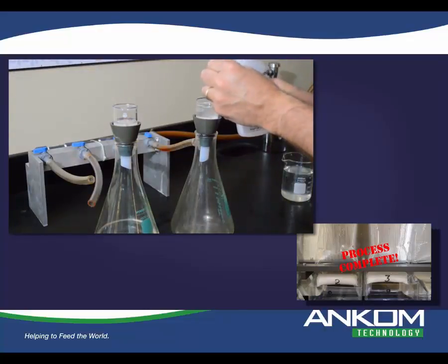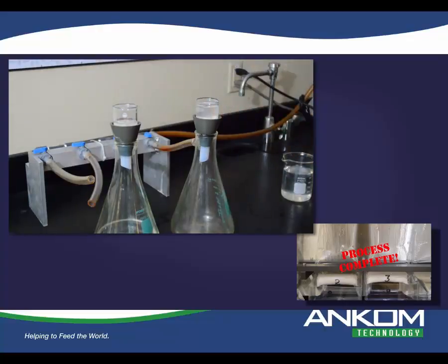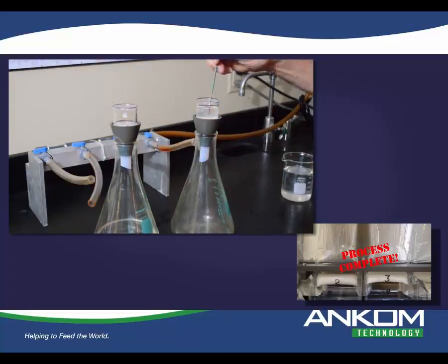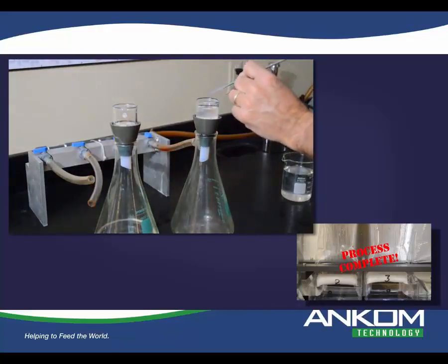We even had a customer that I observed who wasn't just scratching the surface, they were, if you will, stabbing the fritted glass crucible all the way to the glass. You could actually hear them hitting the fritted glass portion of the crucible with the metal spatula, and they didn't see any problem with that.